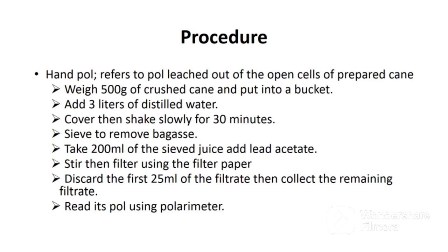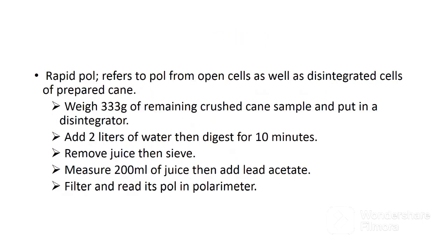After 30 minutes, sieve the juice to remove bagasse. Take 200 ml of the sieved juice and add lead acetate. Stir, then filter using filter paper. Discard the first 25 ml of the filtrate, then collect the remaining filtrate. Read the pole of this filtrate using the polarimeter.